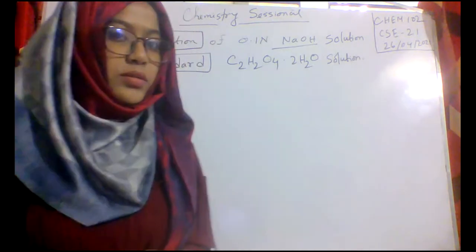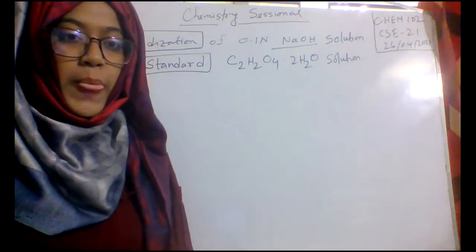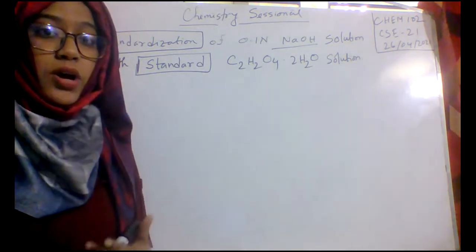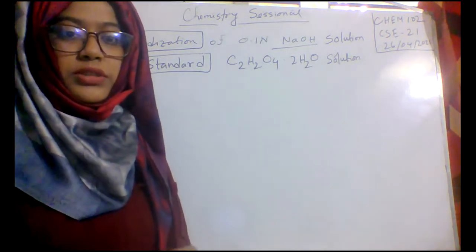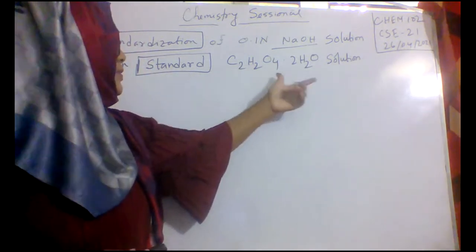So today, I will start experiment 1 of the chemistry session of class. The title of experiment 1 is Standardization of 0.1 normal sodium hydroxide solution with oxalic acid dihydrate solution. Standard oxalic acid dihydrate solution.